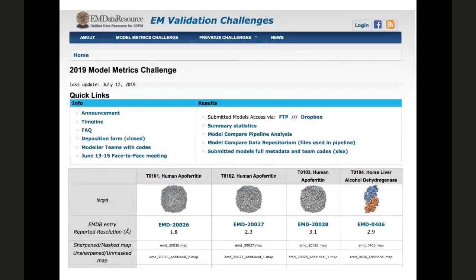Now let's quickly switch gears. Let's go to electron microscopy. So EM Data Bank, every year, announces a modeling challenge, and they give a number of challenge densities, and you're supposed to come up with the best possible structures, and then people compete to find out which structure has scored well. So we competed in all 4 categories this year, like last year. So we, the MDFF team, if we may, are regular attendees of this challenge.